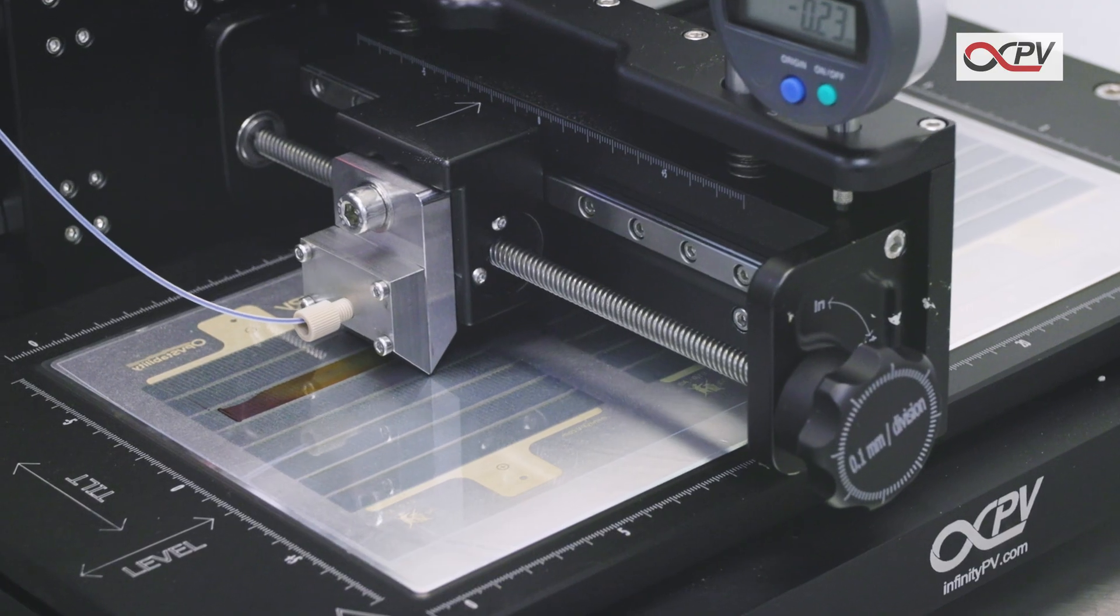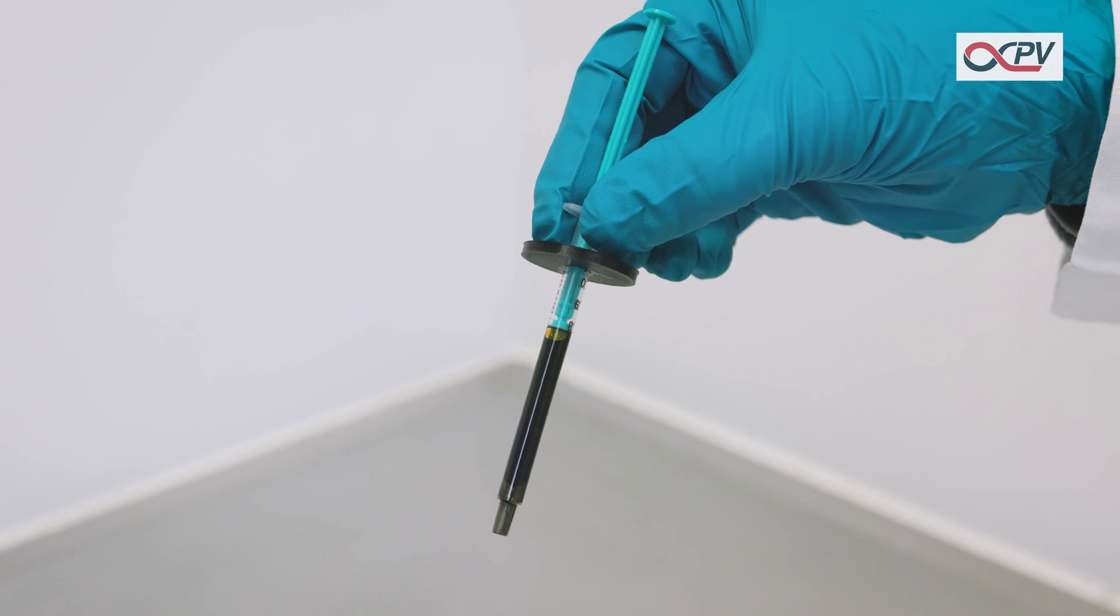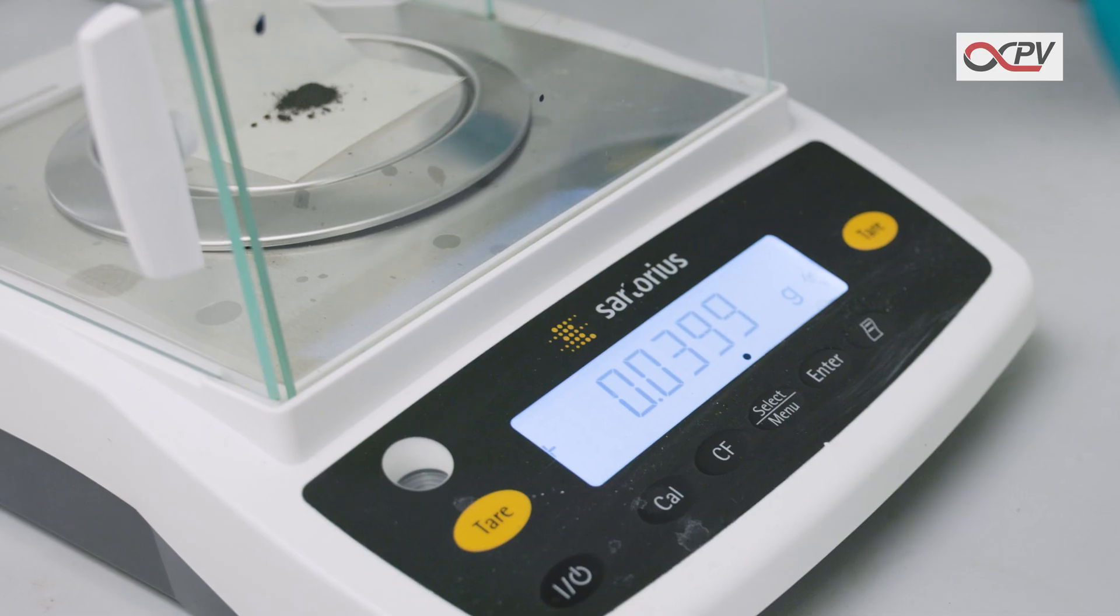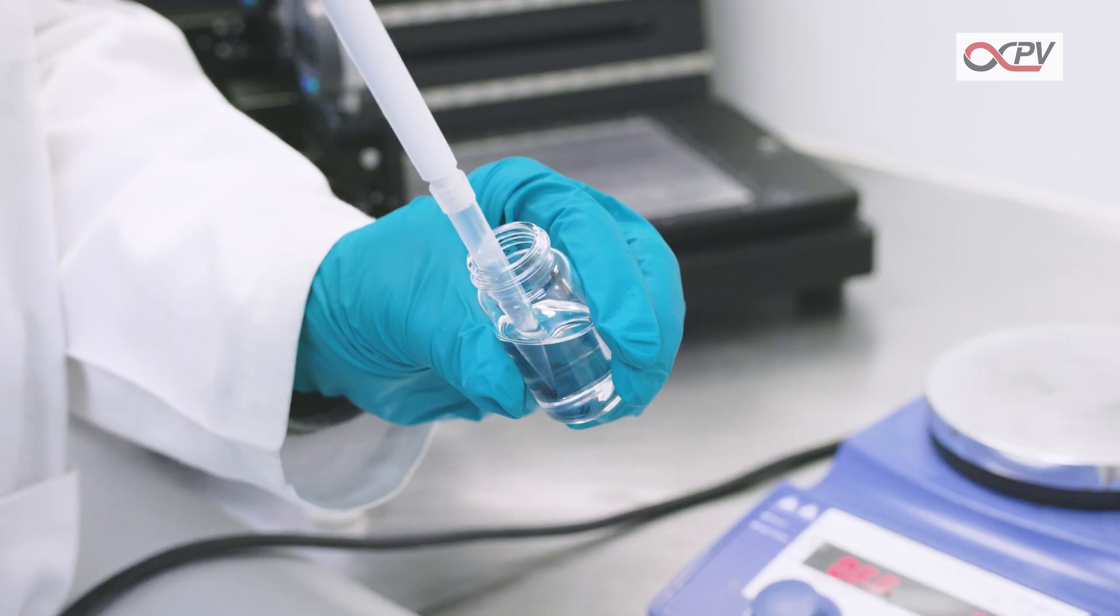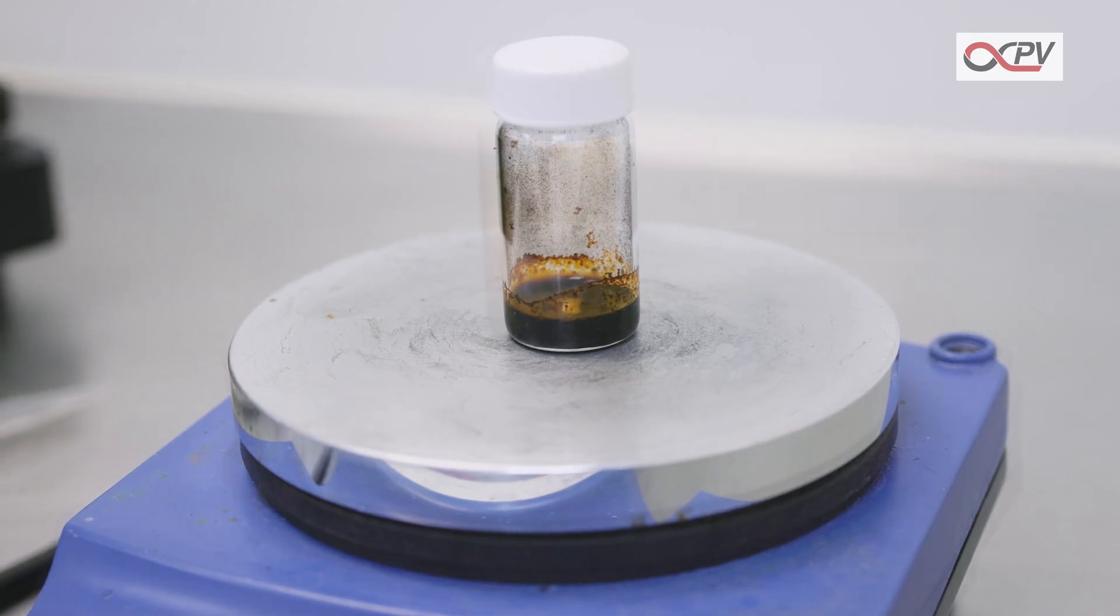How to make solar cells using the Slot Dye Coater by Infinity PV. Start by preparing the ink. Weigh off the active material, add solvents, and stir at elevated temperatures to dissolve the active material.